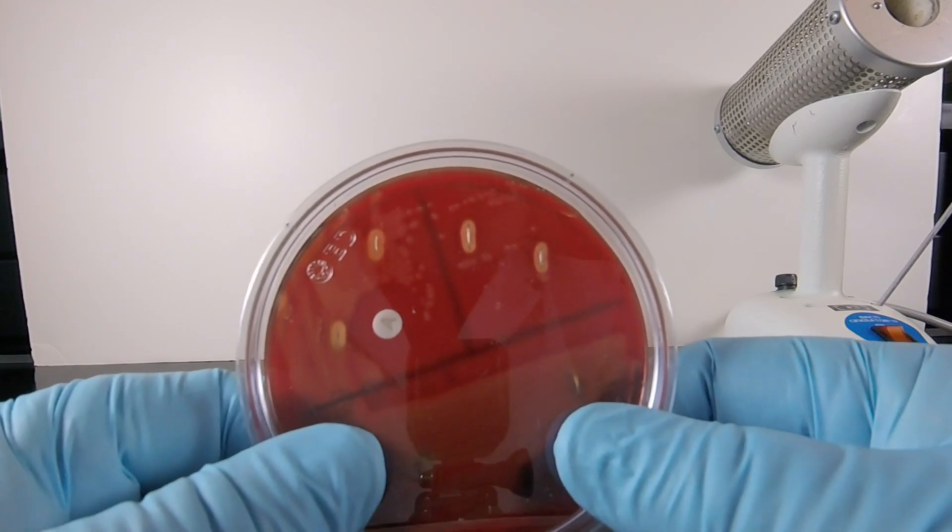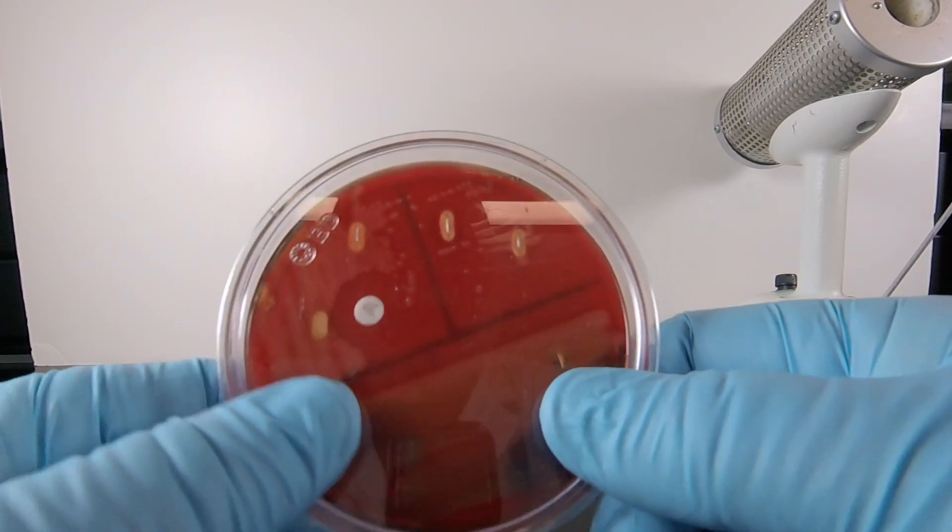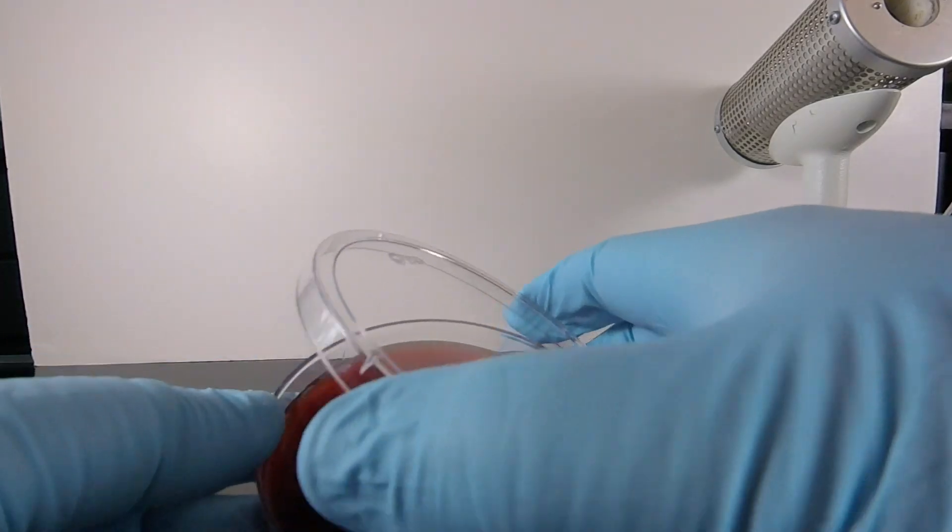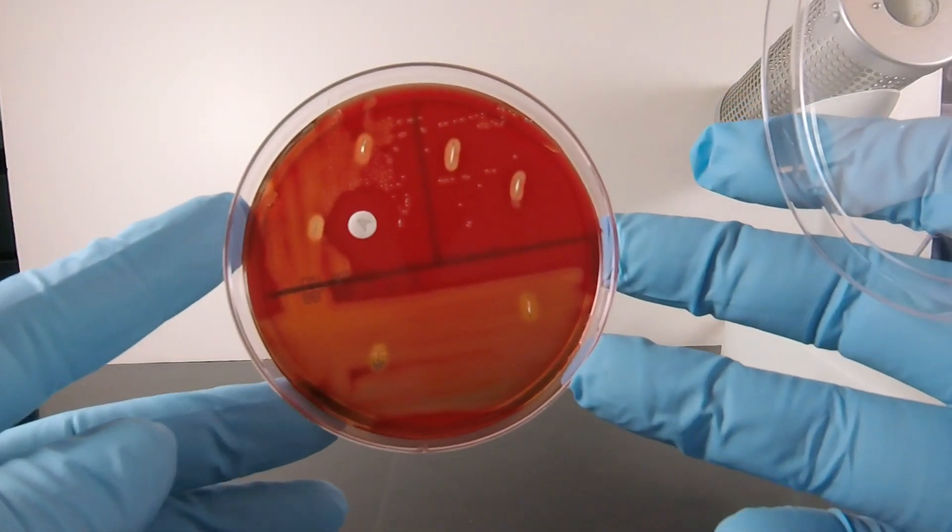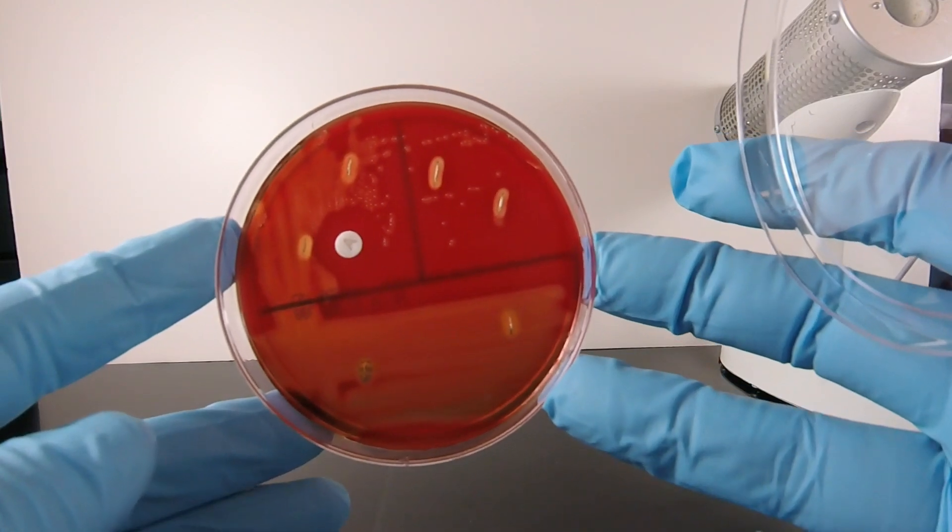Now you can see this nicely just by holding your plate up to the light. I'm going to take the lid off because of the reflection problems. Let's get a little closer look. You can see very clearly the beta-hemolysis.